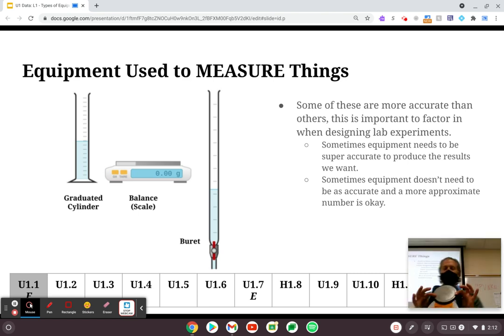The electronic balance does the same thing, except it has a little math program that's coded into it that simply subtracts out or negates the amount of gravity that's on the pan. When you're at home and you stand on the scale, it doesn't do that. It simply just takes the mass of you and the gravity pulling down on it, and so that's the subtle difference. Kind of not super important, but it is important in some ways.